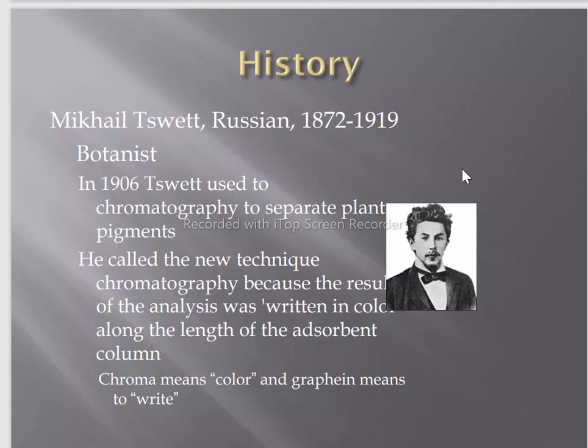In this series of videos we are going to discuss all about chromatography, starting from the basics. So what is chromatography? Why is its name chromatography? Who discovered the word chromatography?